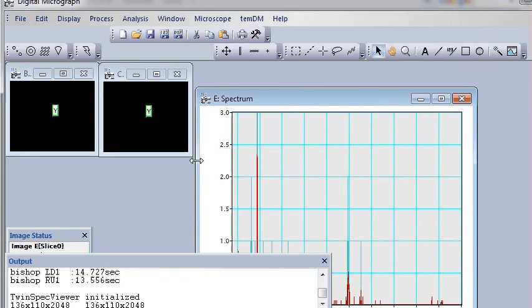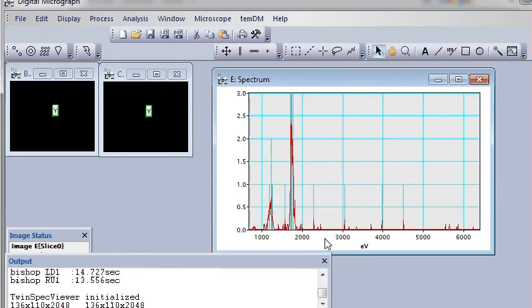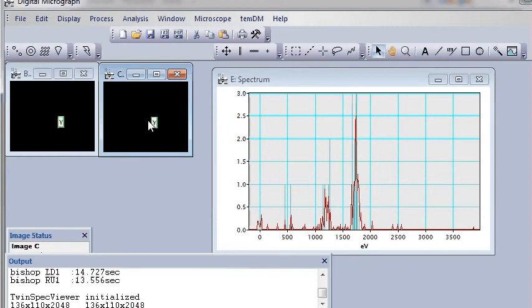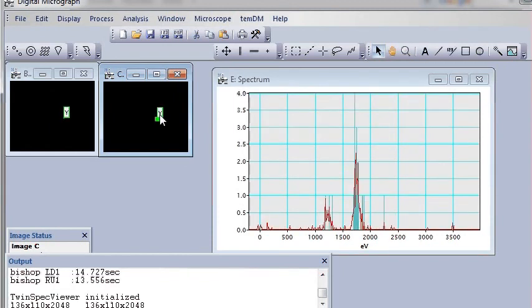Here we have a plot where there are two spectra from the two data cubes plotted as an overlay. So you see that the old data cube is the blue, very sparse signal, and the new is the red smooth curve. We can also travel along the data cubes. Both markers move synchronously, and we see that this situation is everywhere. To stop this viewing, just close this display without saving.